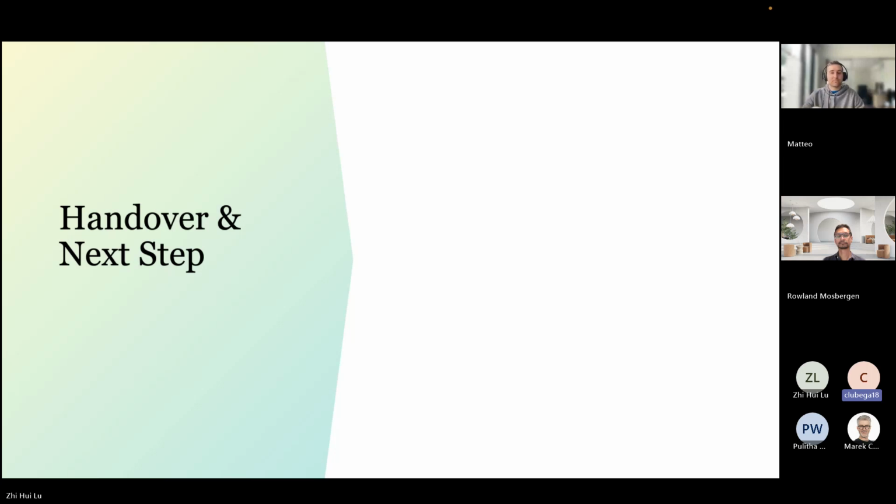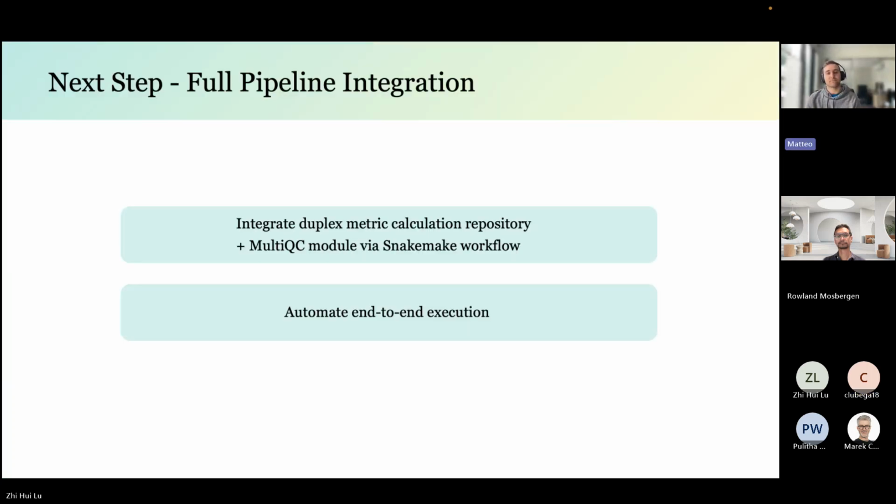So in terms of handover and where we left off, I would like to have the next cohorts do a full integration of the Calculate Duplex metrics repo with MultiQC via Snakemake for better management, and also to automate the end-to-end execution.